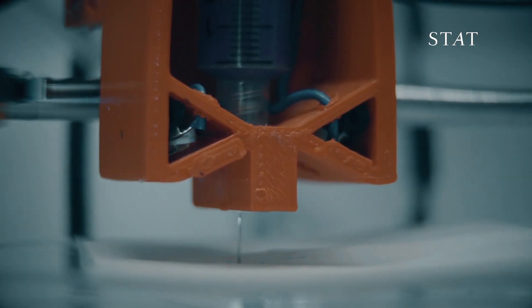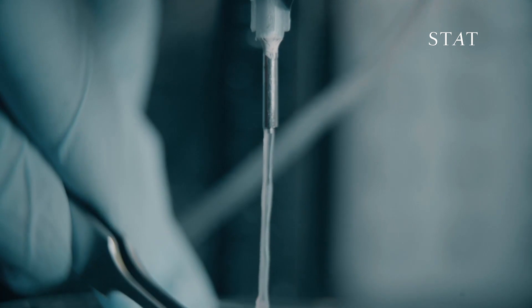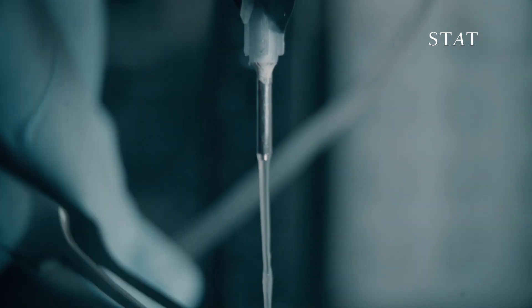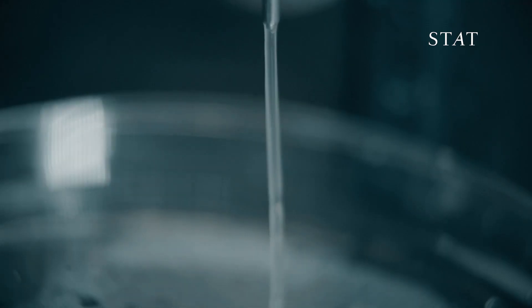To print the vessels, Jung's team created a specialized nozzle that can print multiple layers in one sitting. We're using a material called a hydrogel.